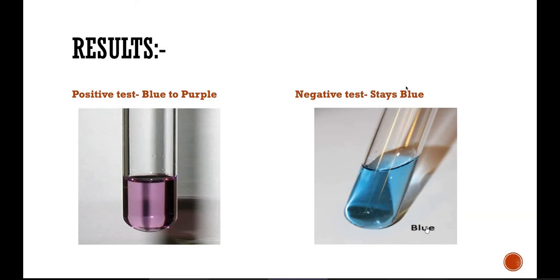Now, one more thing I want to mention is that the intensity of the color is directly proportional to the number of peptide bonds in your solution, meaning that the darker the color, the larger the number of peptide bonds there are. So just keep that in mind whenever you're conducting or thinking about conducting this experiment. Well, this was my attempt, a very messy attempt in conducting this experiment. I hope you enjoyed it, maybe learned something.